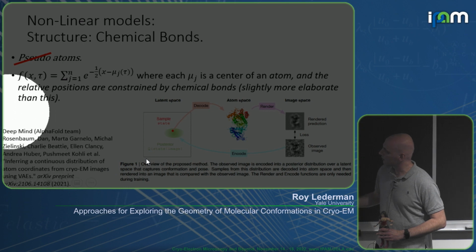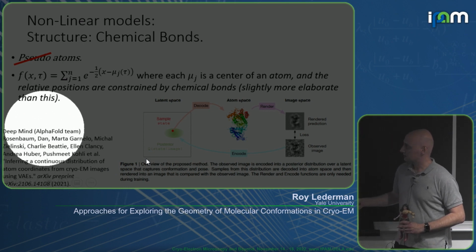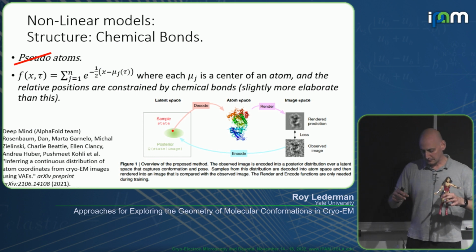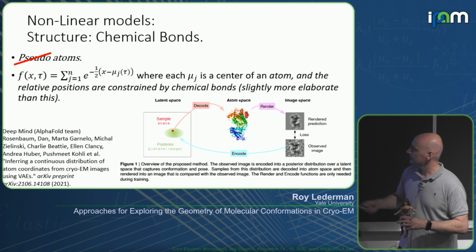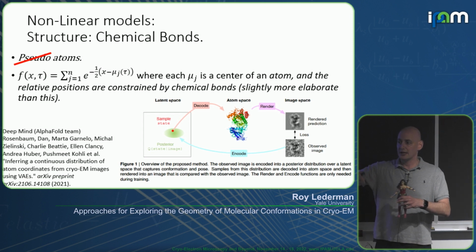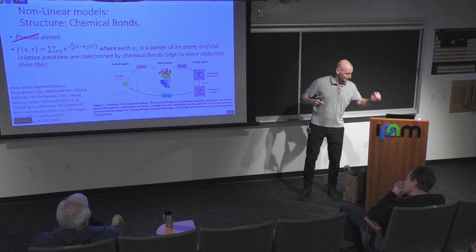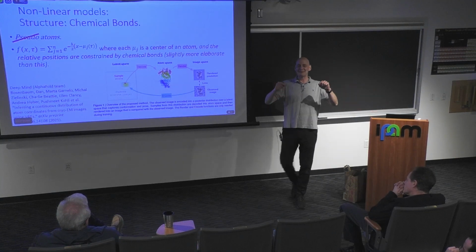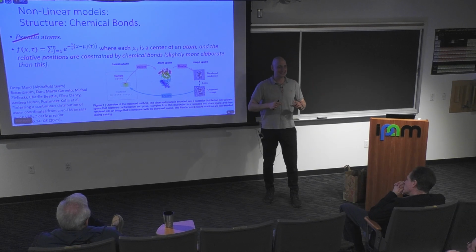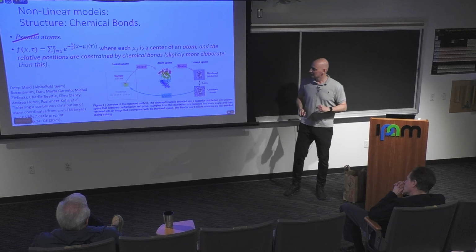This is work that came from the AlphaFold team, with some ideas from AlphaFold, to write these functions, which are basically these GMM models, but imposing these chemical bonds between the different atoms in the molecule, imposing the actual atomic structure.